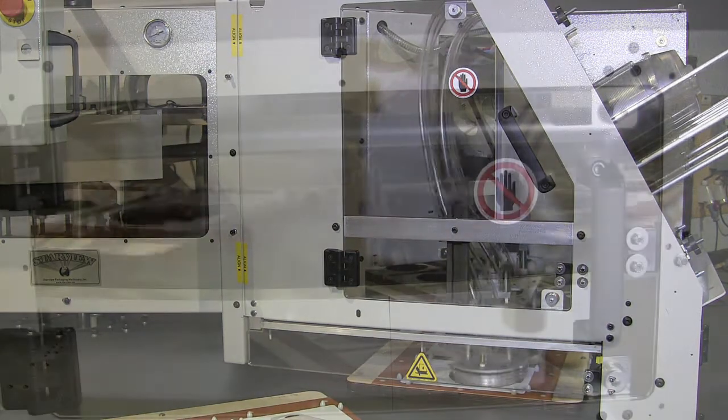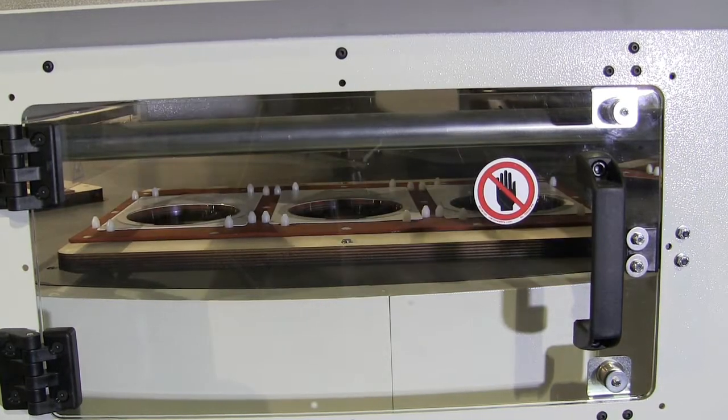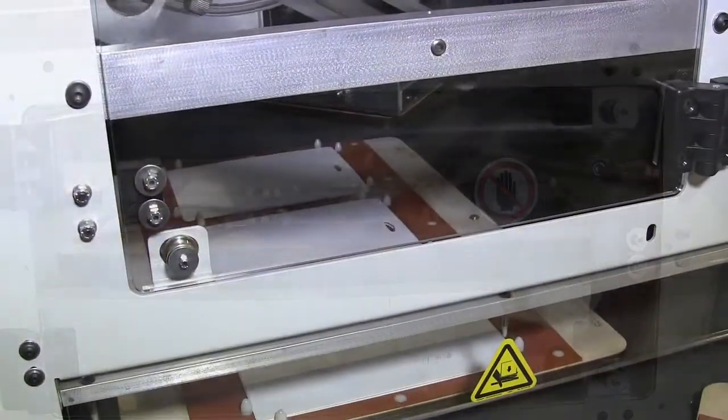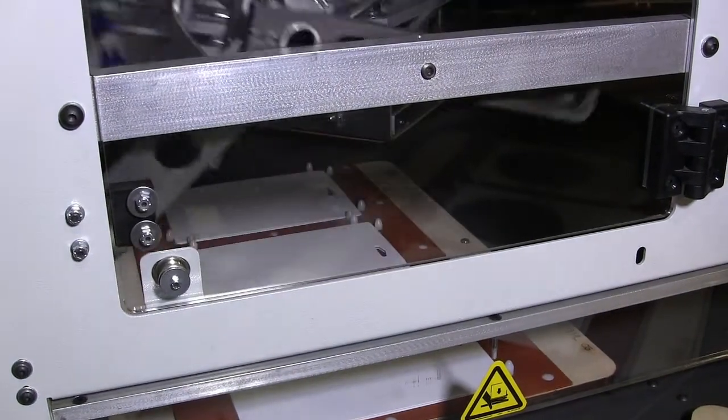The FAB8-3 series automated rotary blister sealing machines are built with the capability to feed front cards, blisters, and back cards, and unload finished packages when proper tooling is installed.